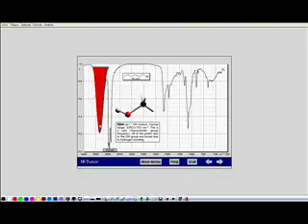If you were in my lab last semester, if you remember, for the last two experiments that we did where we converted the alcohol to the alkyl halides, we did a quick check using the infrared to see if there was any alcohol left in the molecule. We were looking for that OH peak at 3,500 to 3,600. So we can use this as a test to make sure there's no water, there's no OH in the sample. The rest of this, though, is exactly the same. For this hexanol, what's below 3,000? All the alkane CH stretches.